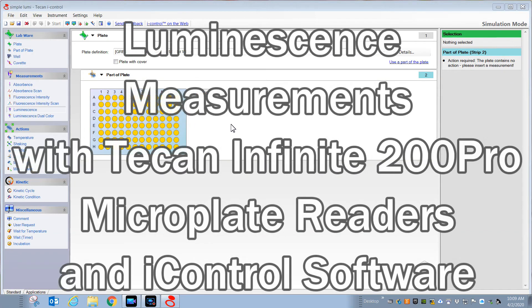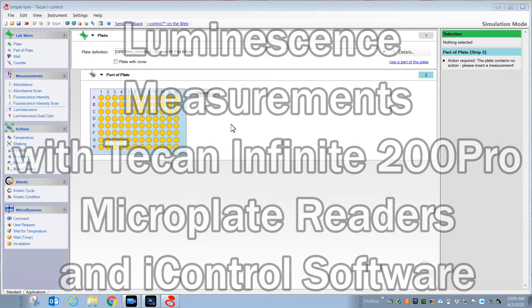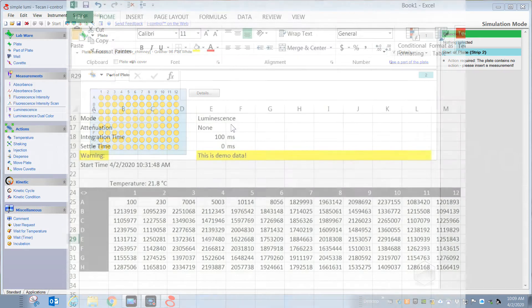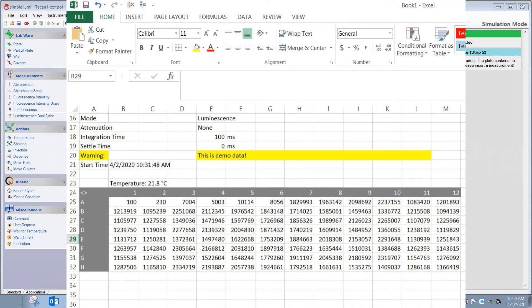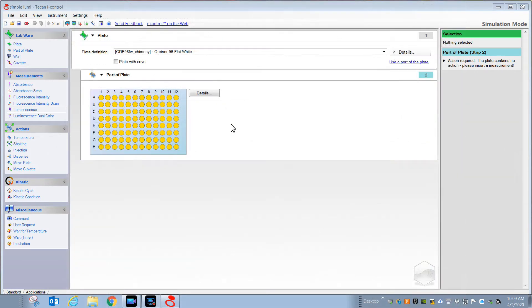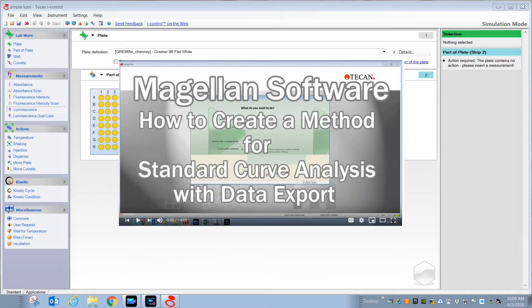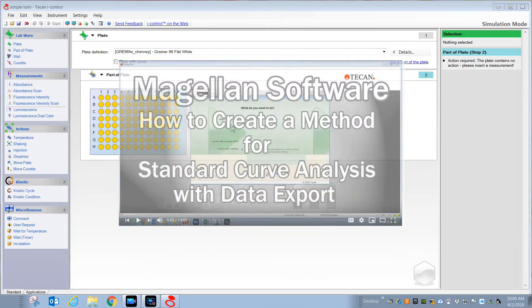This video will provide a brief introduction on how to capture luminescence readings using the TECAN Infinity 200 Pro microplate readers and iControl software. The iControl software will deliver raw data directly to Excel without any data analysis. If you're looking for a way to capture luminescence data as well as get curve fitting functionality, then you'll want to look for videos on this channel or contact TECAN about using Magellan software for that purpose.